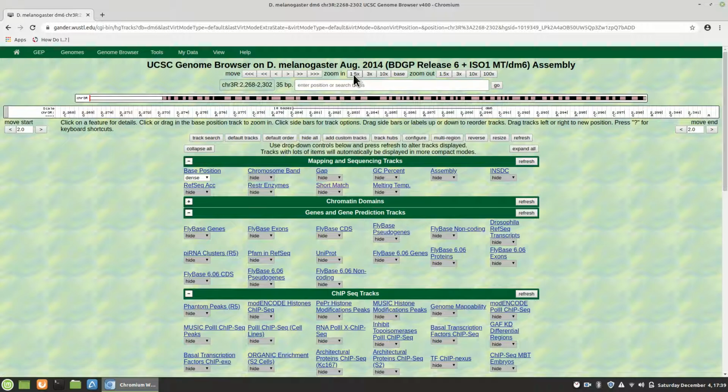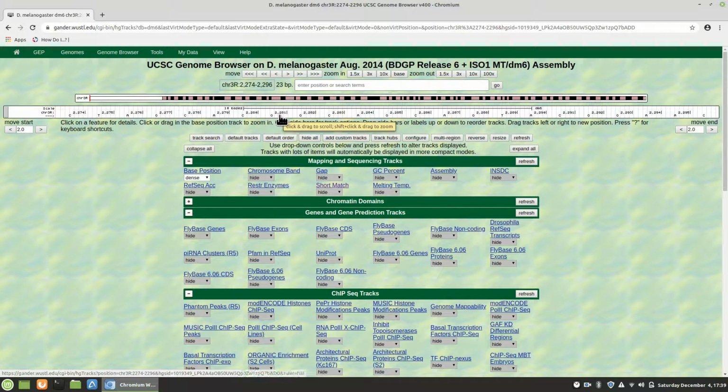Now we're seeing them on the bottom. Sometimes you see them on the top. But like I said, you can zoom in so much that here we have individual bases. All right, and it's telling us where we are. We're at 2,281, and that's a G. All right, we have 10 bases through here. So this is how you use this.